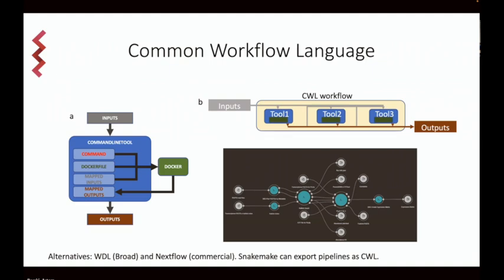And part of the way is, of course, to use Docker images, but you also needed to provide more detailed descriptions of your tools and pipelines than what can be done on GitHub. And so people came up with several workflow languages.